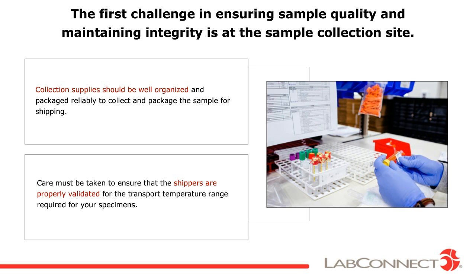Thanks, Liz. In addition to the collection tube types, shipping supplies and conditions are also another critical component to this process. Shippers must be validated to ensure that proper temperatures are maintained. Samples must be packed correctly to avoid damage or loss during shipping.